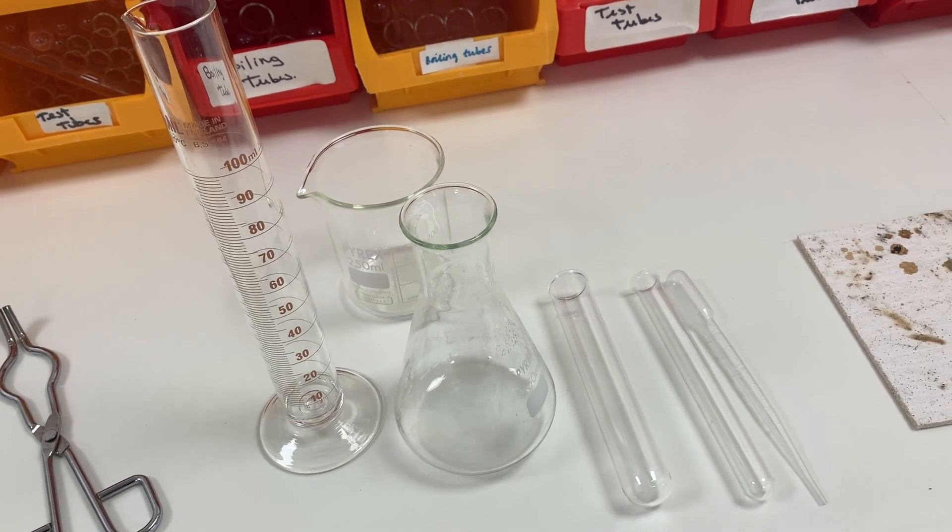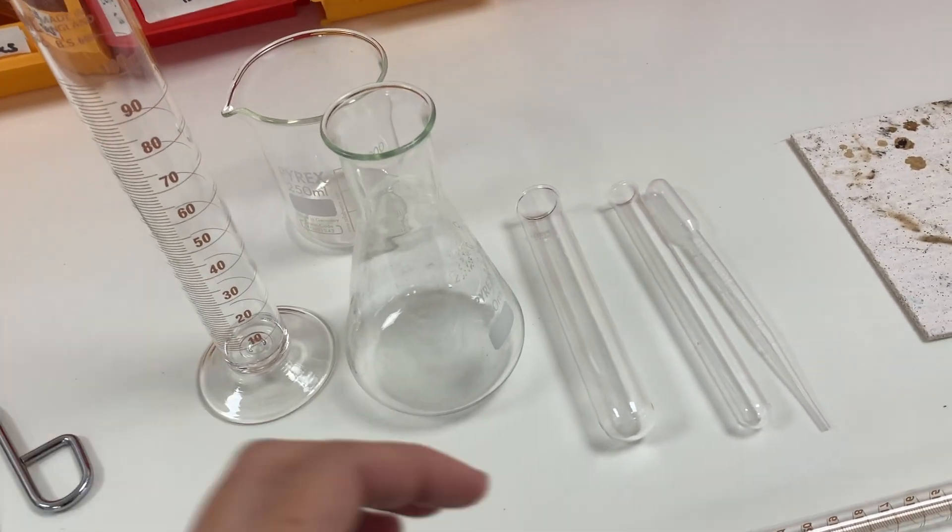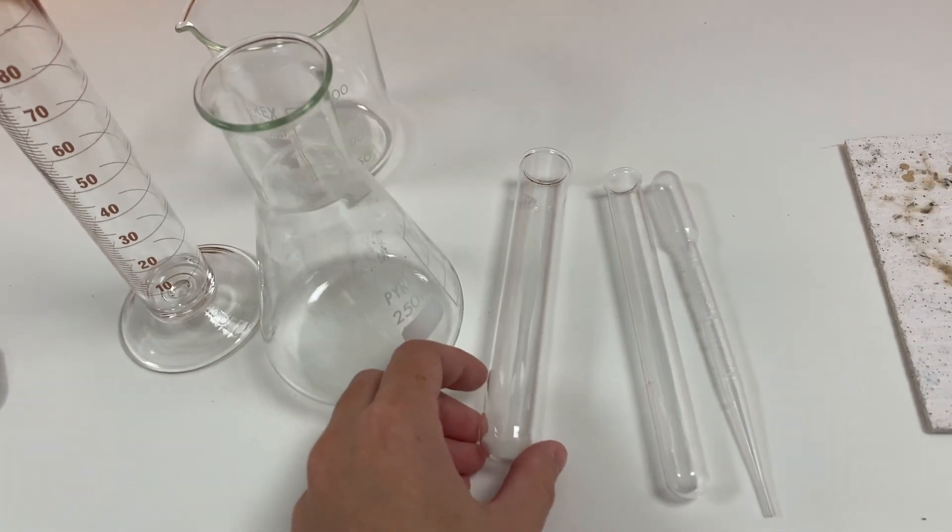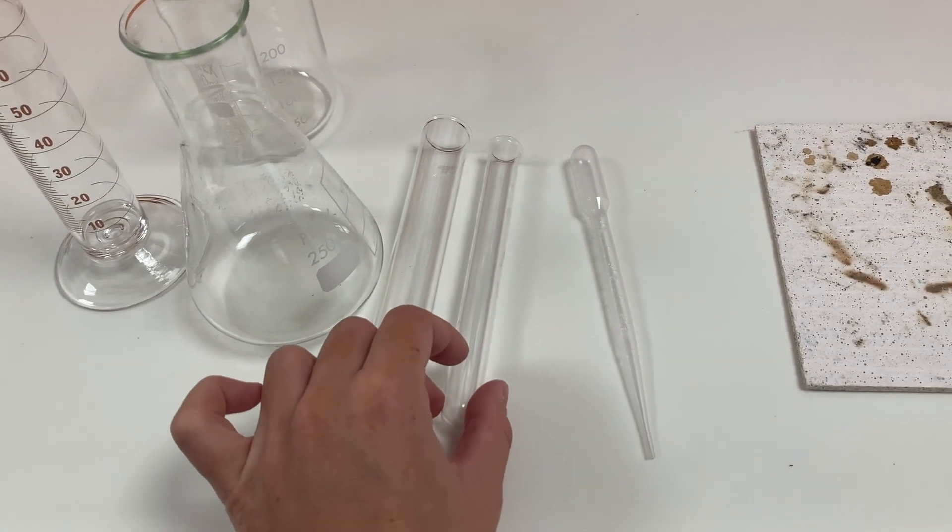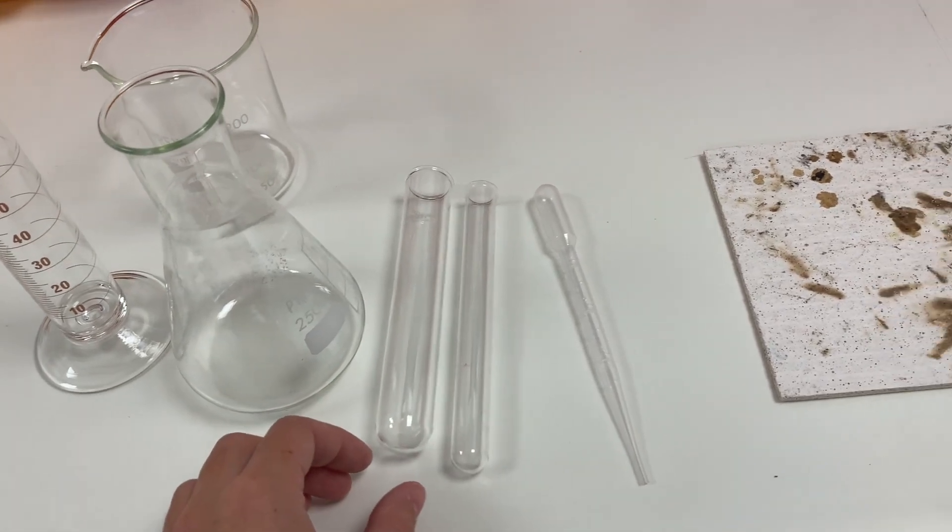Moving on, we have a boiling tube, not to be confused with the smaller test tube. The boiling tube is just a larger version of the test tube.